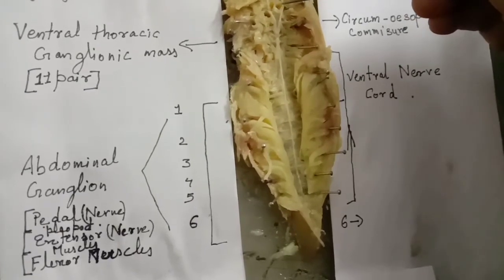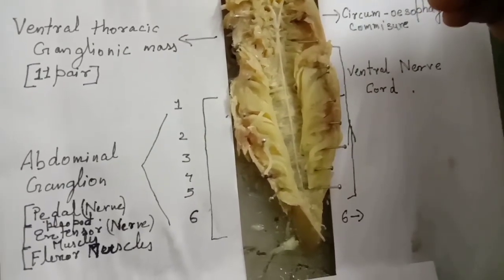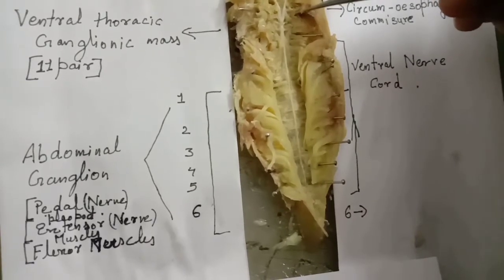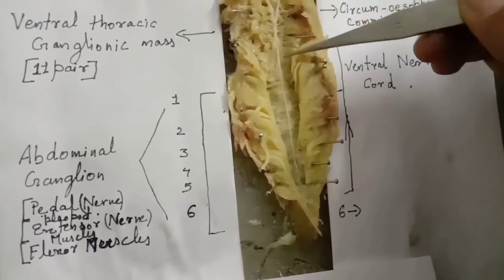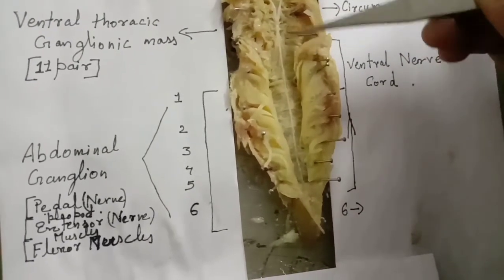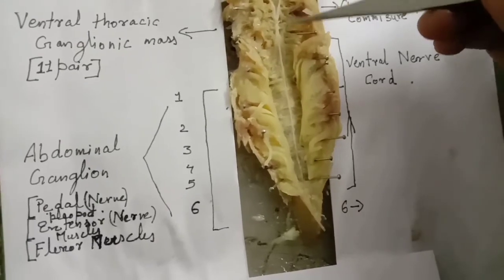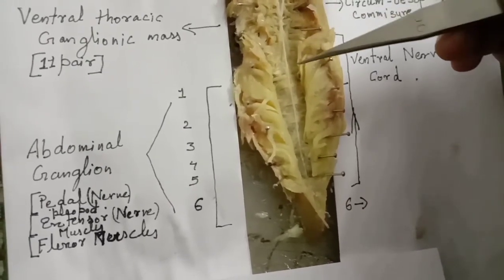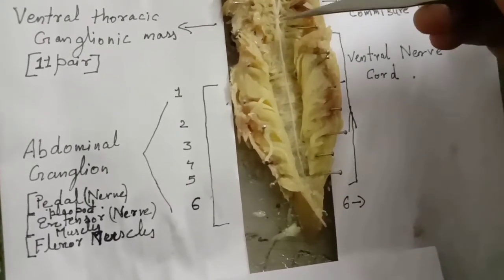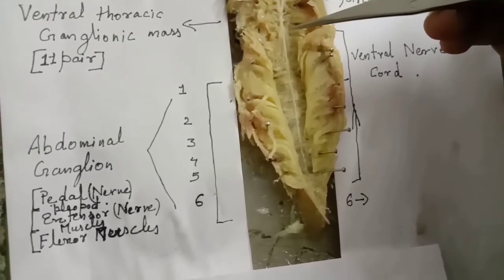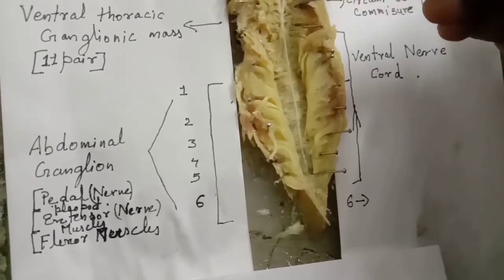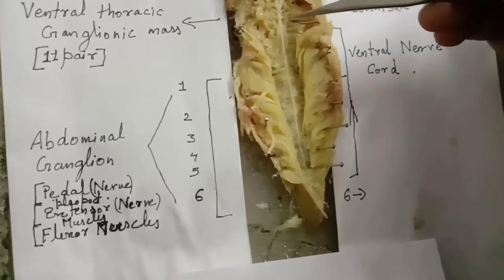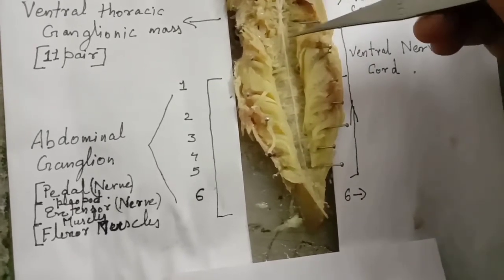The subesophageal ganglion is fused with the anterior part of the ventral thoracic ganglionic mass. It is an elongated oval structure lying immediately above the thoracic sternum plate in the midventral line. Flowing nerves originate from the ventral ganglionic mass.